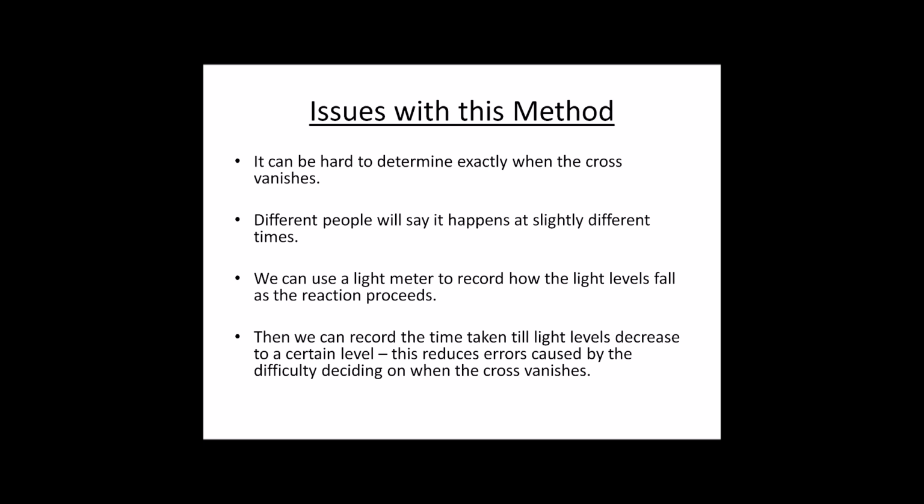Now, a lot of the time in schools, a lot of schools don't have lots and lots of light meters to give to a whole class to do this experiment, which is why it doesn't get done like that. Also, a lot of the time the light meters might need calibration or careful care, and if they don't get those on a regular basis or they're not treated very well, they can lose their accuracy as well.